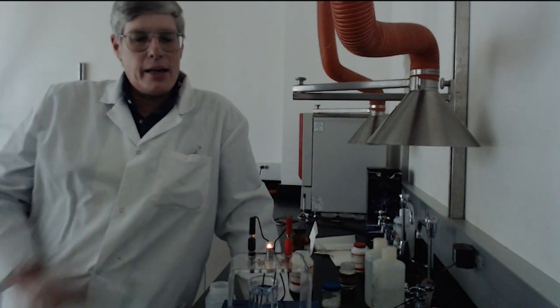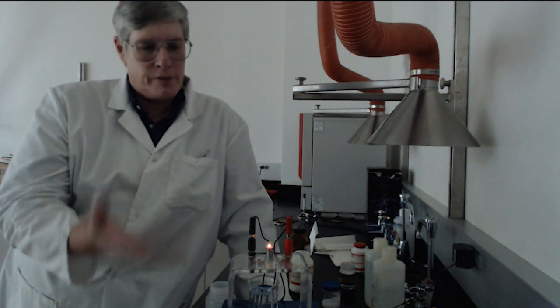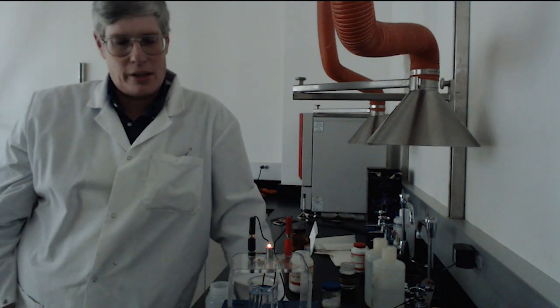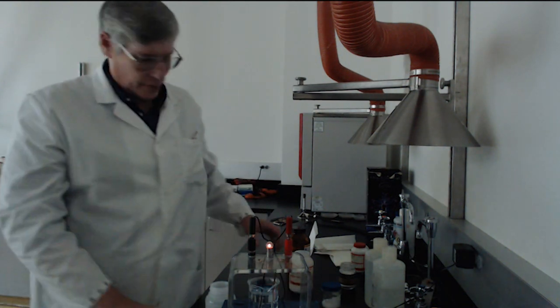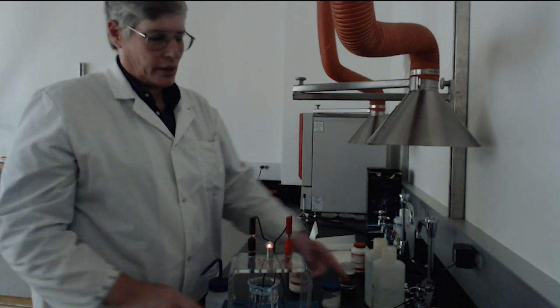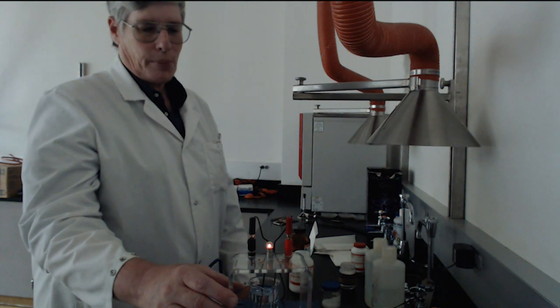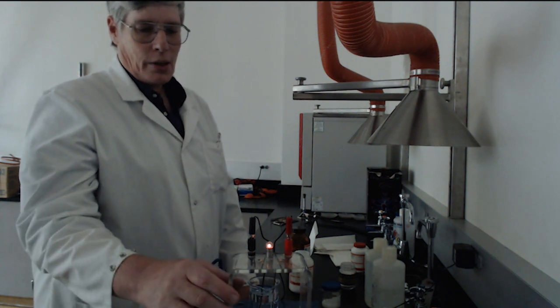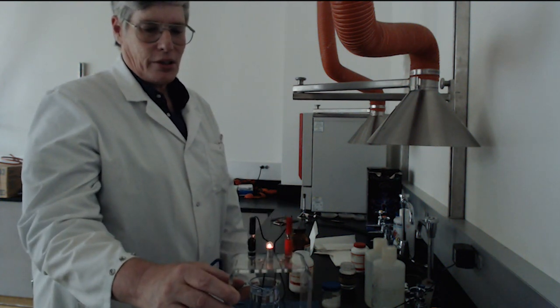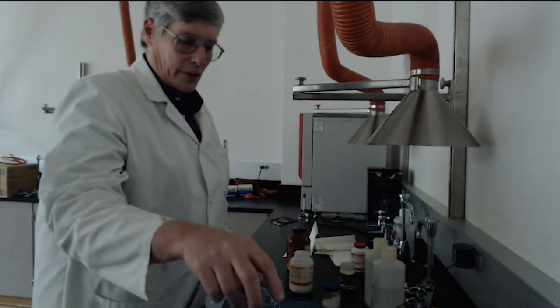In the lab today, we are going to do a proportionality of the number of ions versus the amount of conduction that the computer records. It is whether it conducts 1-to-1 or it does not, like in the weak cases. Your job is to see if there is a direct proportionality to the number of ions with the same concentration versus the conductivity.